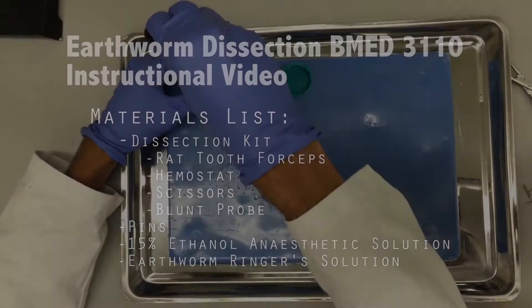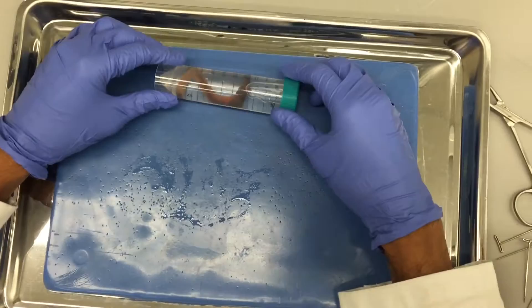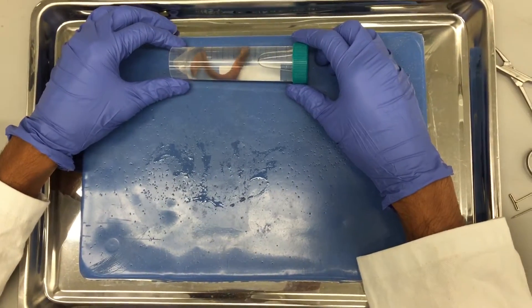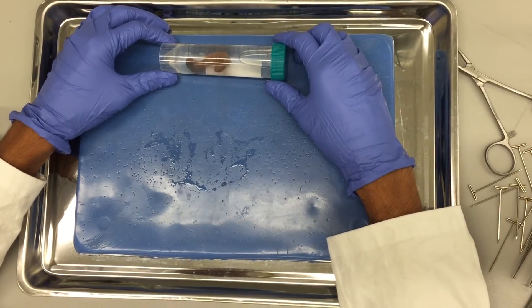Once you have obtained and rinsed off an earthworm, you will place it in 15% ethanol solution to anesthetize it. Leave it in the ethanol for about 5 minutes or until there is no visible movement.